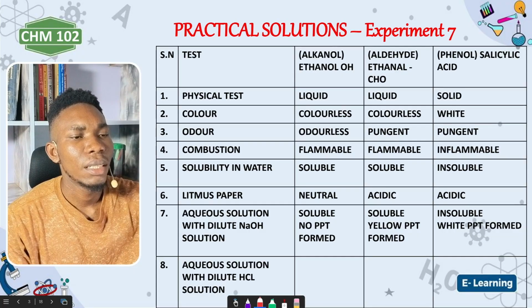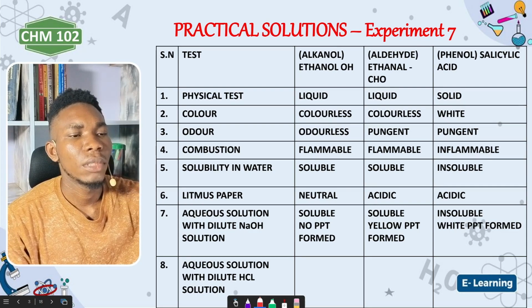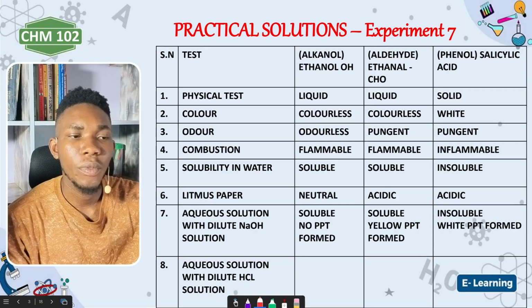Solubility in water. Are you sure? Salicylic acid is not soluble in water. Is it insoluble in water? Right? I've said it's insoluble, but it's supposed to be soluble in water because of the different functional group that is there. Just write what you have there as your result.